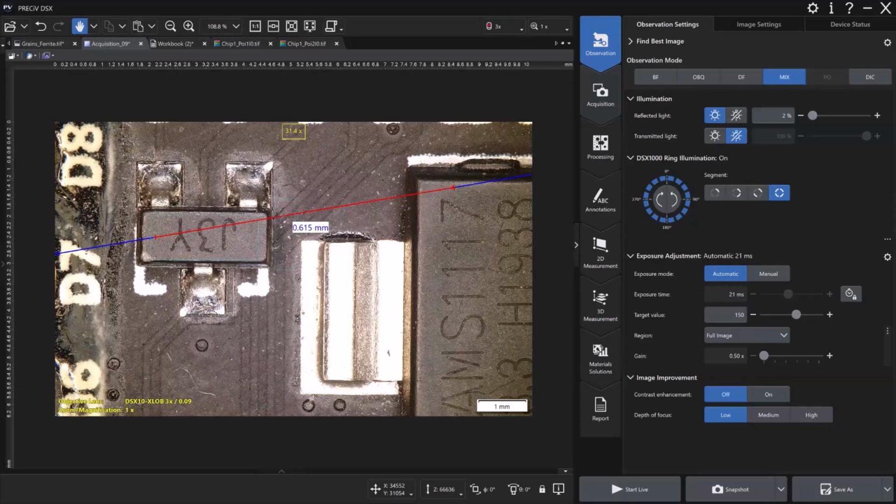But the frequency they're talking about is check calibration. So that's just done with your measurements. You can put on a verified standard and do a calibration verification at any point.